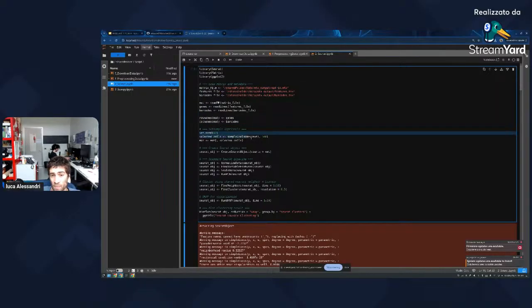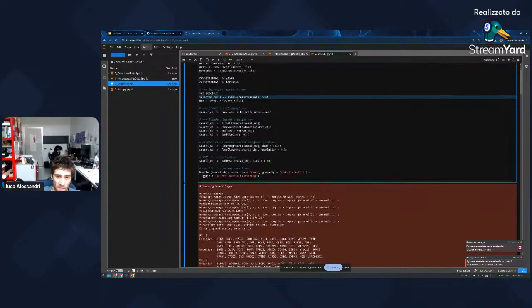Then here I subsample again, and I pick 500 cells. As you can see here, I set the seed. Since I asked for 500 random cells, it would be different if you run it on your computer without setting the seed. But since the seed is set, this will always be the same.